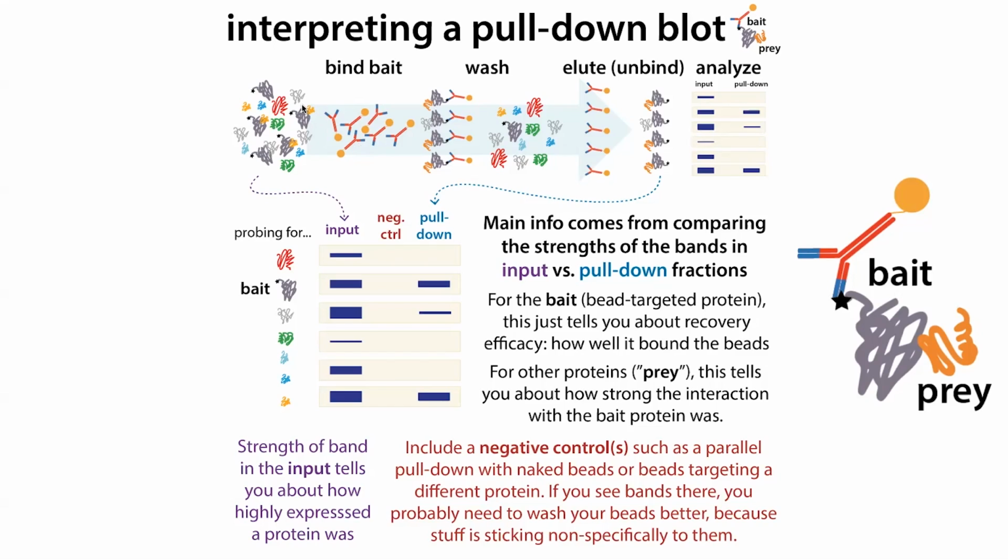So instead of having to genetically engineer a bunch of different cell lines, or introduce a bunch of plasmids into cell lines, you can make and purify different versions of the bait that you want to test, and then mix that in with your lysate.